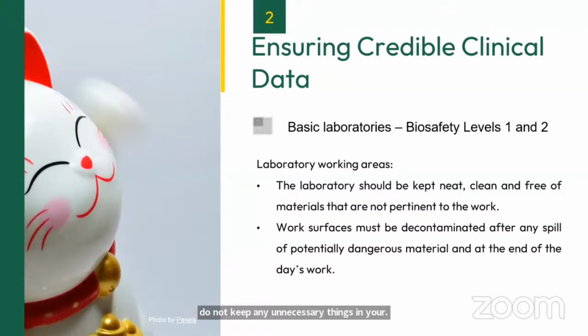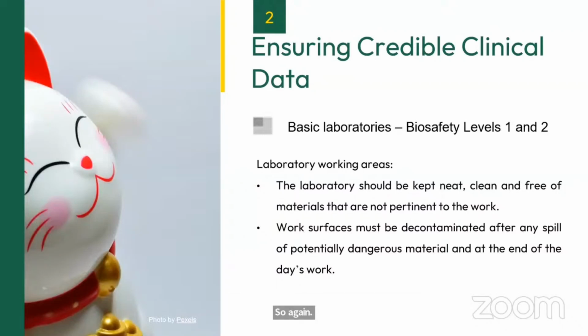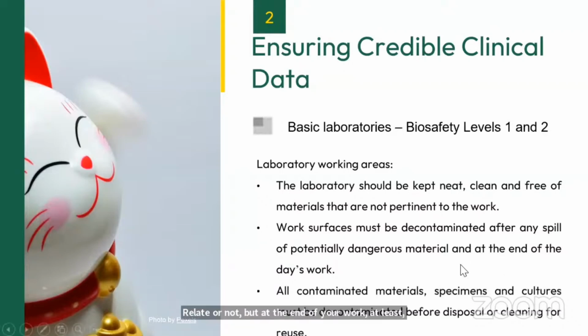So maybe you are carrying your laptops or any other things. Don't carry it, at least in your laboratory working areas or processing areas. Work surfaces must be decontaminated after any spill of potentially dangerous material and at the end of the day's work. So again, there should be appropriate decontamination of workbenches and surfaces, whether there is any spillage or not. But at the end of your work, at least you should clean it appropriately.